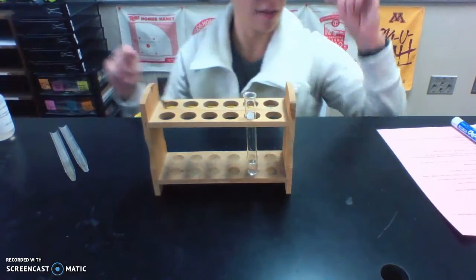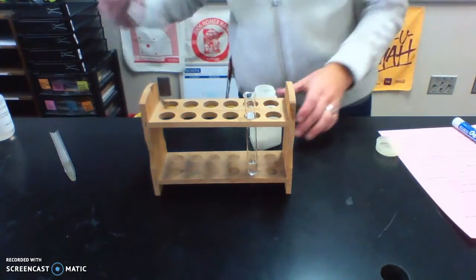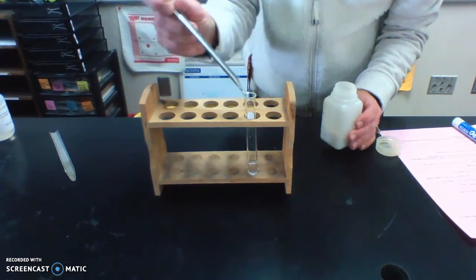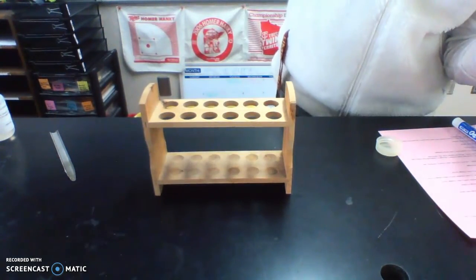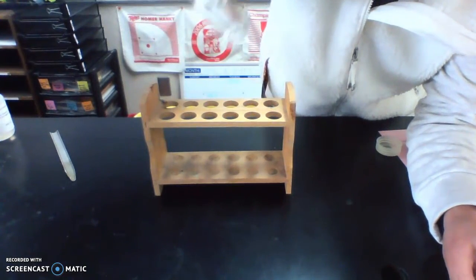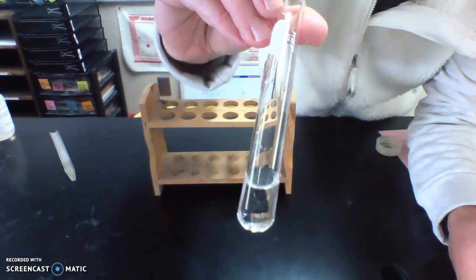Okay, and then I'm going to add one more crystal, a seed crystal. So I'm going to take my potassium nitrate, scoop here. I'm going to try to get just one, but they're pretty small, so it's probably going to end up being a few. Can you see them on the bottom there? That kind of fuzzy on the bottom, that's the seed crystal. It did not dissolve.